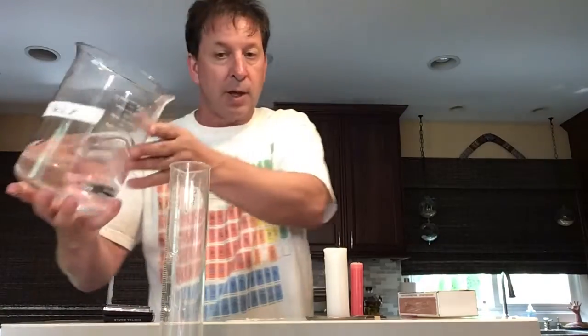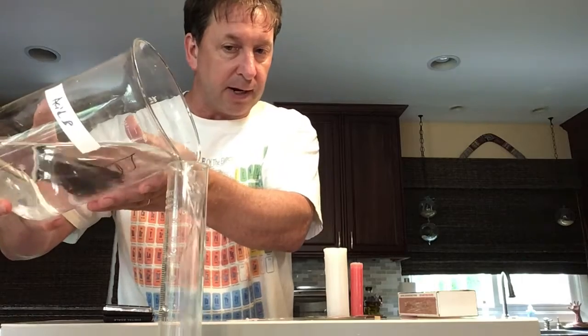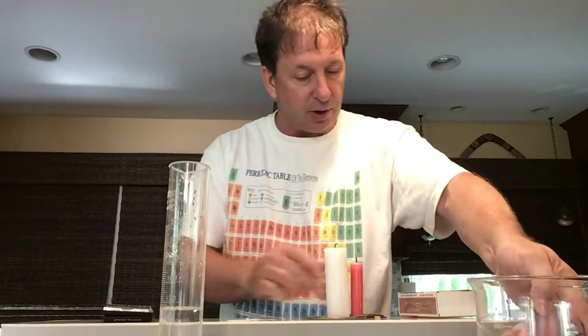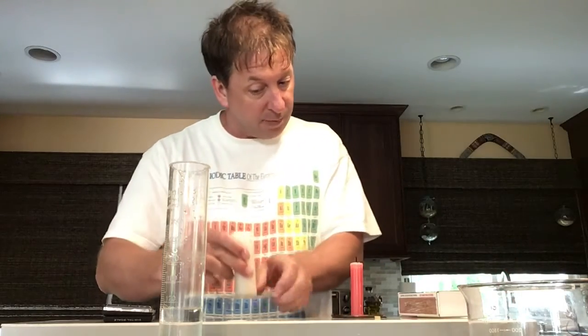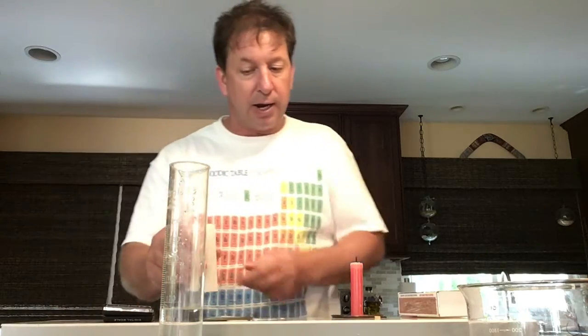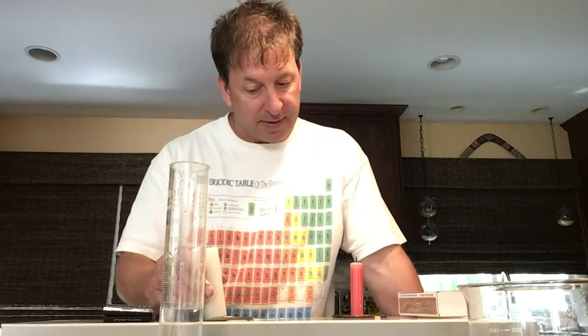We will also go ahead and do the same thing. We'll record the volume using water displacement technique as well, okay? Now, one of the problems you'll run into is that some of the wax might have dripped onto here, and there might be a little bit that's on here. If that's the case, then what you might want to do is just add maybe 1 or 2 milliliters when you record your final volume, okay?